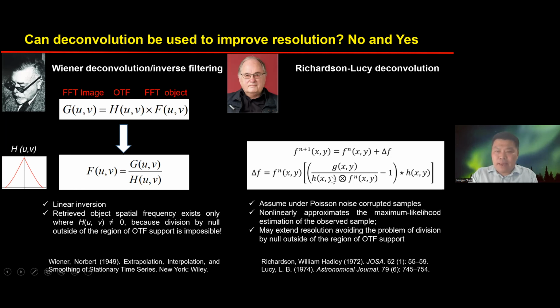Then we compare that with the image we really get, keep the similar parts, and multiply the different parts by H, the point spread function, again for another round of iteration.